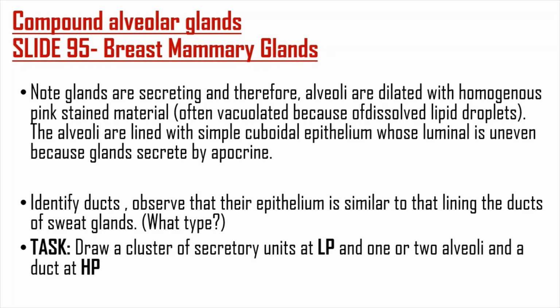Now let's move on to our mammary glands. What type of glands are in the breast? We'll look at the breast both in the lactating phase, when a woman has a child and is breastfeeding, and in a non-lactating phase.